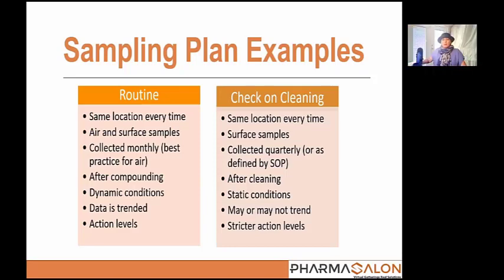Okay. My last question is, with repeat and consecutive excursions, do you need to recall everything prepared since the last passing result? That's also a really great question. And some of that I'll cover later on as well, specifically with what to do when we've had multiple excursions in this particular location.